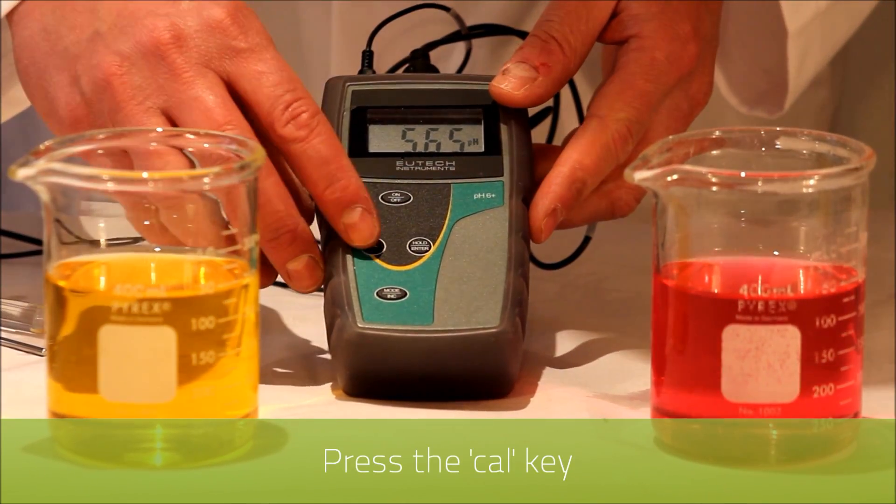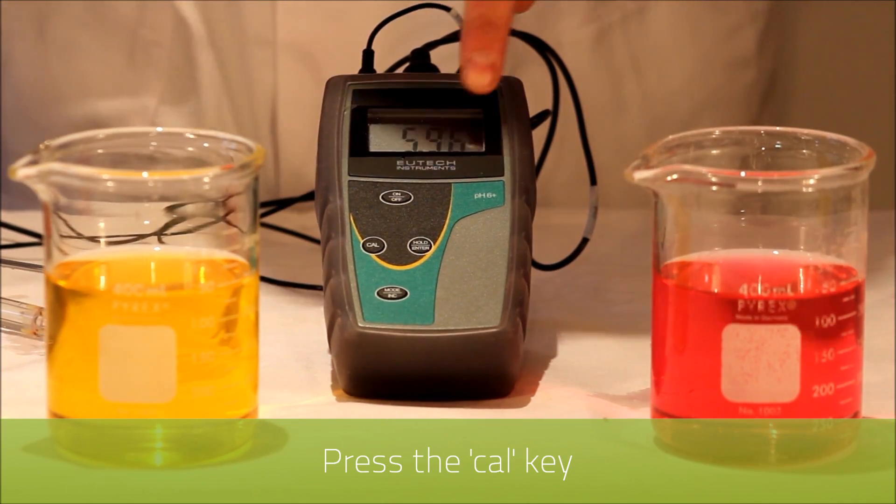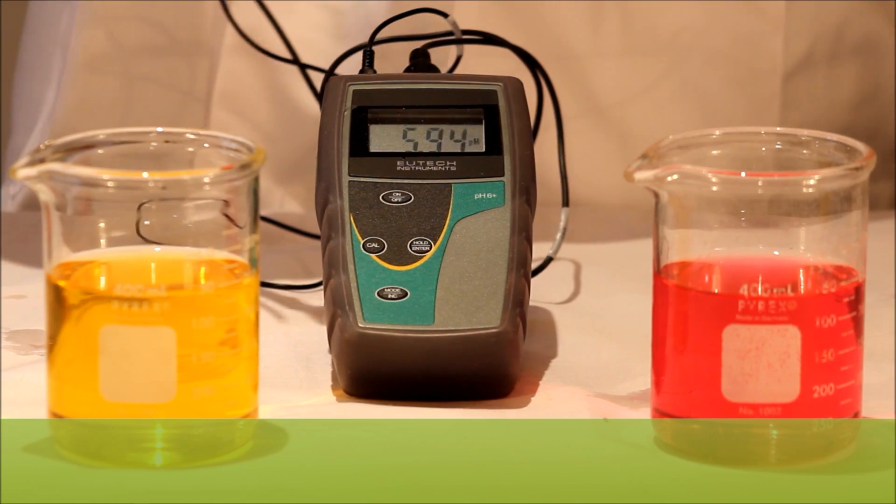First of all we press the CAL key to enter calibration mode, and you'll notice that the reading is flashing. This indicates that you are in calibration mode.